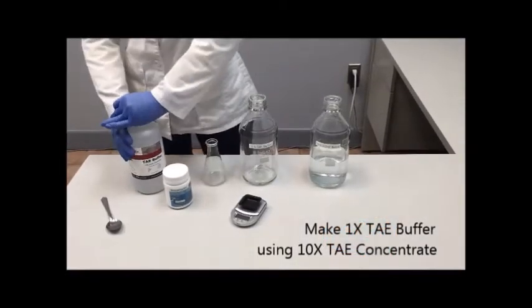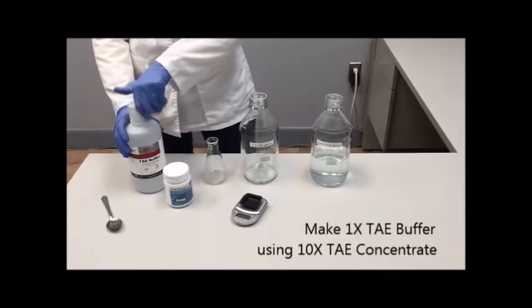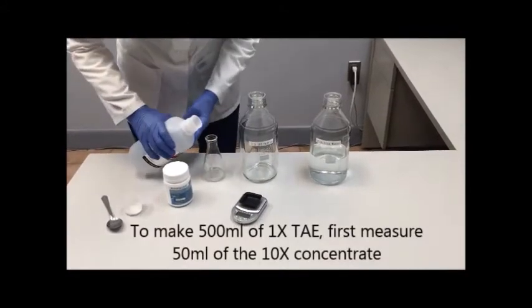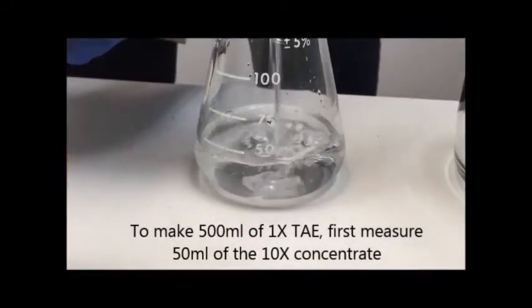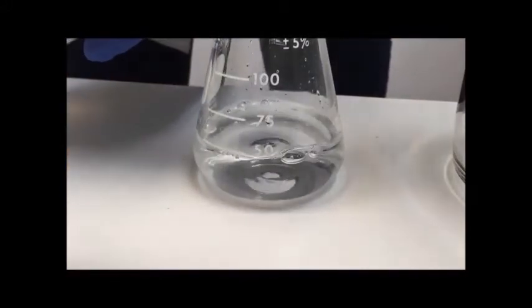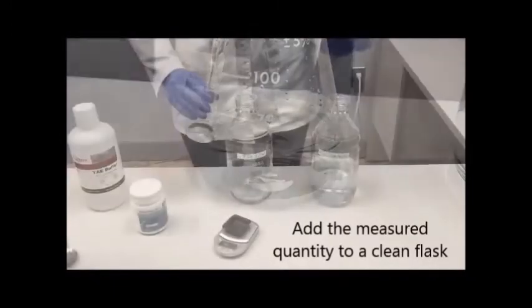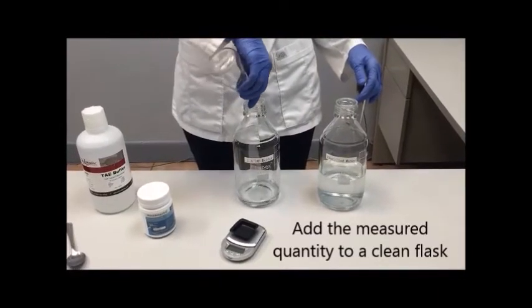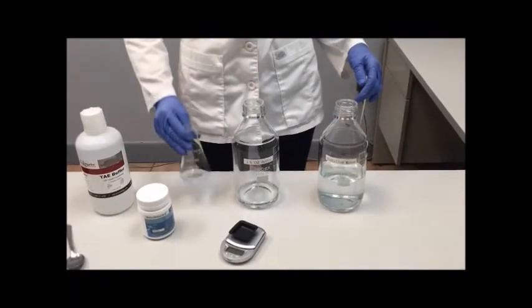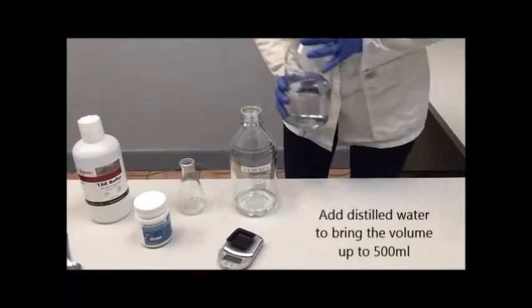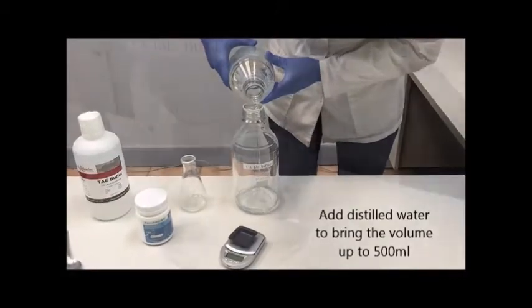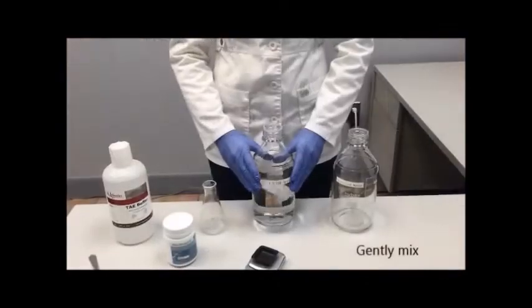Our first step is to make 1x TAE buffer using our 10x TAE concentrate. To make 500 ml of 1x TAE, first we're going to measure 50 ml of the 10x concentrate. We'll add this measured quantity to a clean flask, and then we're going to bring the volume up to 500 ml using distilled water. Then gently mix the solution.